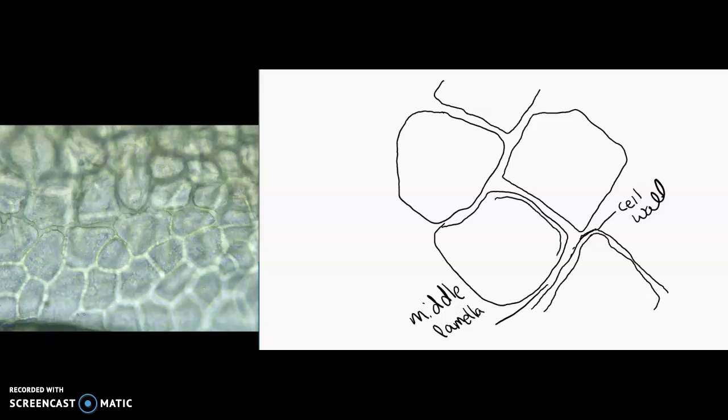That large central vacuole usually pushes up against that cell wall. So there's a little bit of cytoplasm, that large central vacuole.